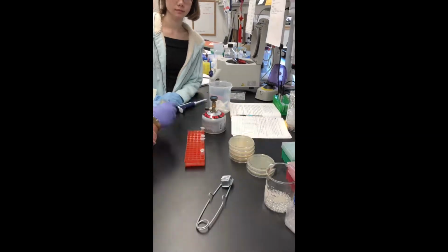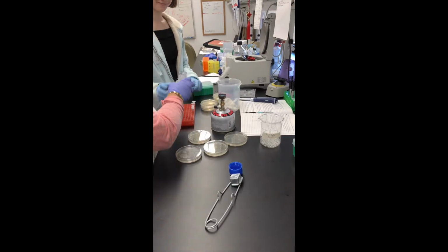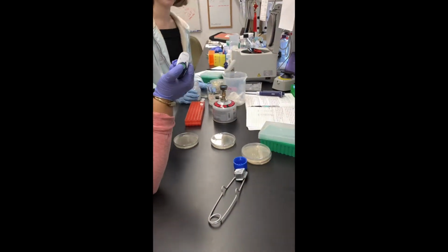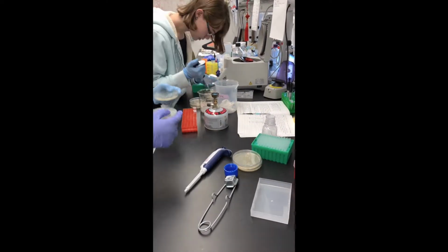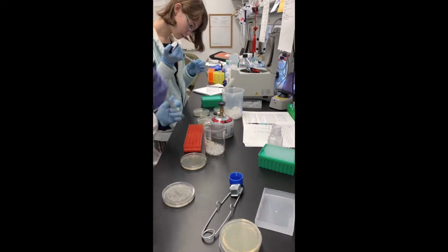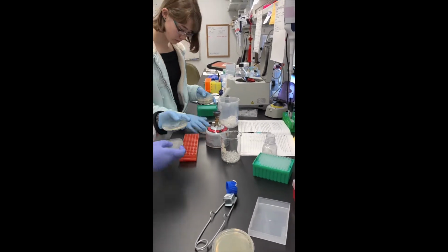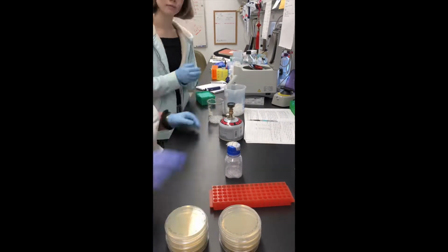And here, Abby and Adriana are doing a bacterial transformation. Previously, they took a plasmid, or piece of circular DNA, and heat shocked some E. coli cells so they would take up that plasmid. Right now, they are pipetting the E. coli onto plates and using shaker beads to spread the bacteria around. Later, they will put the plates in an incubator, and tomorrow they will collect colonies and grow cultures in order to harvest a large quantity of the plasmid.